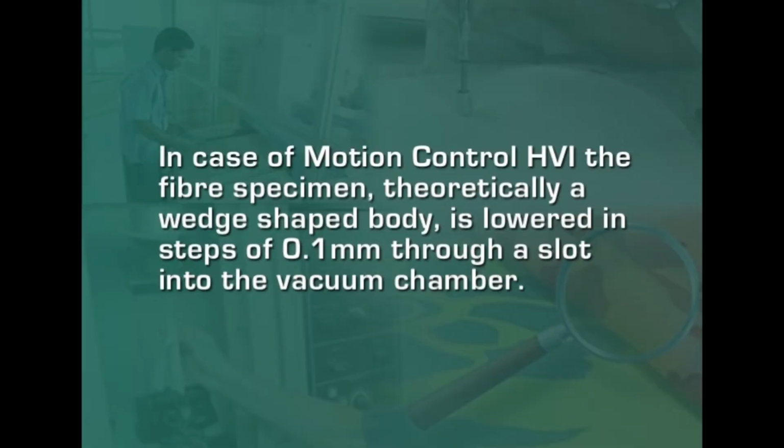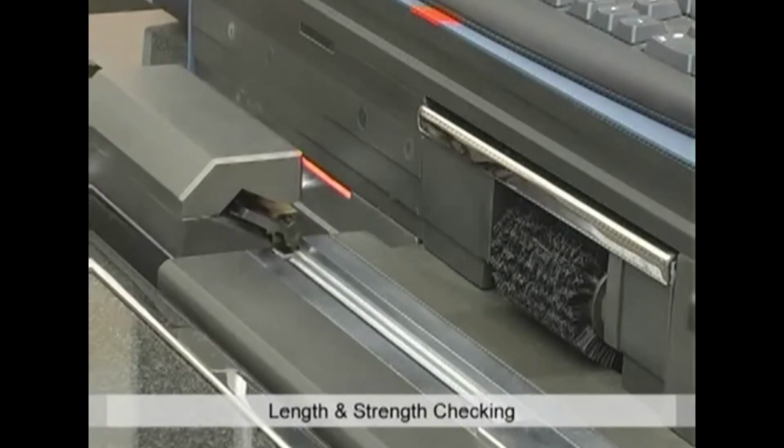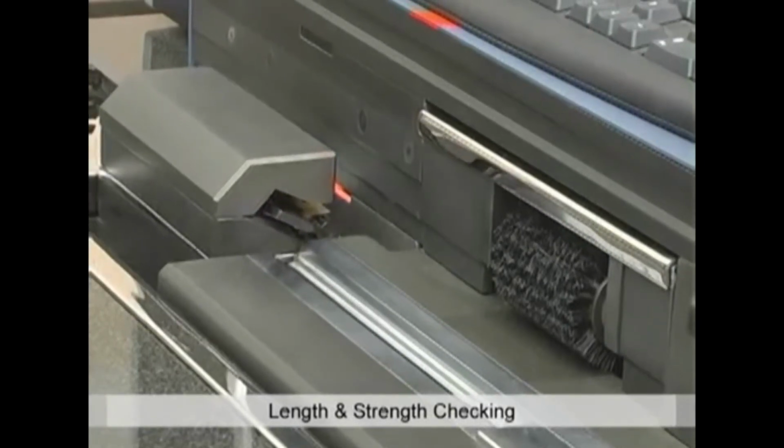In case of motion control high volume instrument, the fiber specimen, theoretically a wedge shaped body, is lowered in steps of 0.1 mm through a slot into the vacuum chamber. The vacuum in the chamber increases as the slot is closed by the wedge shaped fiber tuft. The change in vacuum is proportional to the increasing fiber mass in the fiber wedge. An extremely sensitive sensor converts the changes in the vacuum into electrical signals.